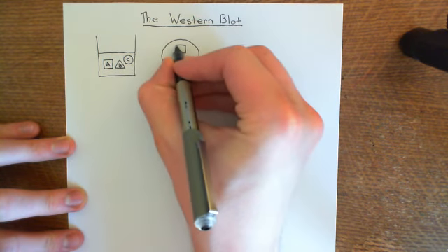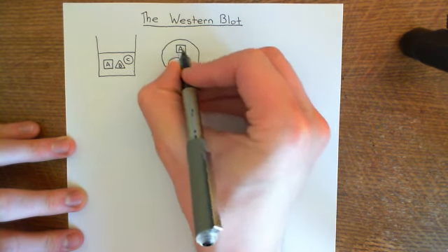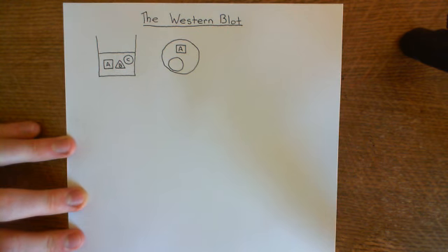So let's say here is protein A, and we want to decide whether protein A is present within the cell. What we're going to perform is a Western blot. This is how we're going to decide whether protein A is present within the cell or not.